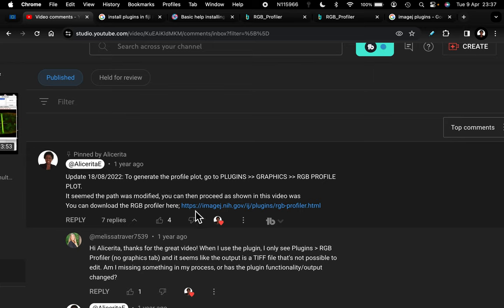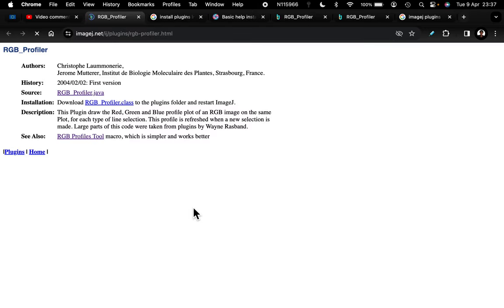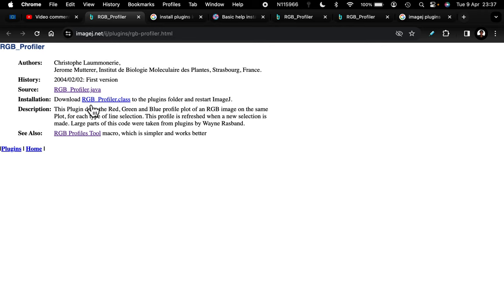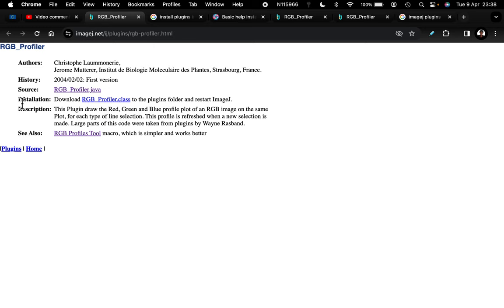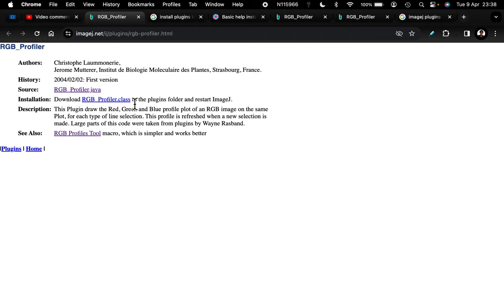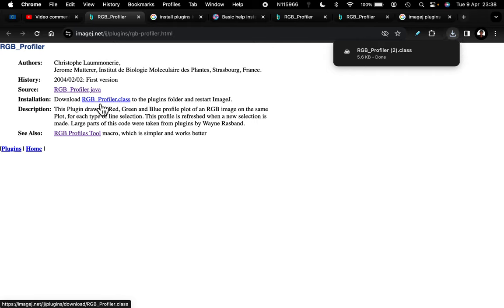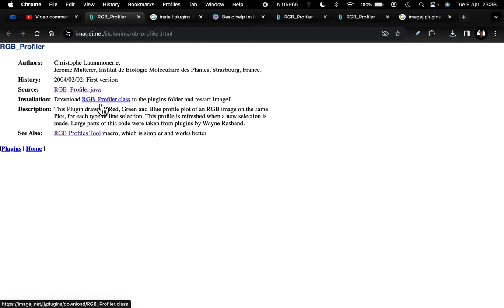If you click on that link, we have here the RGB profiler that we want to install. Normally when you want to install any plugin in ImageJ or Fiji, you need to download where it says installation - download RGB profiler.class. Most of the plugins will be .class files. This particular video is going to emphasize Fiji because with ImageJ it's straightforward, and that is why in the first part of this video you will use this method for ImageJ.